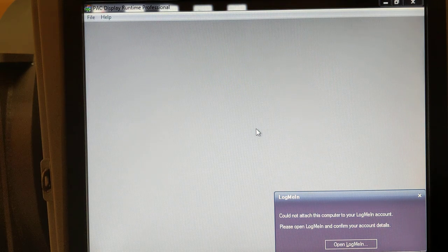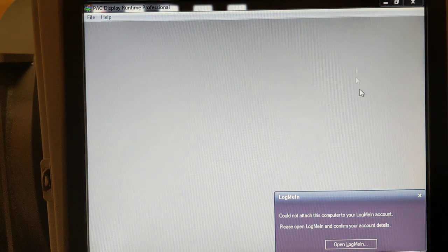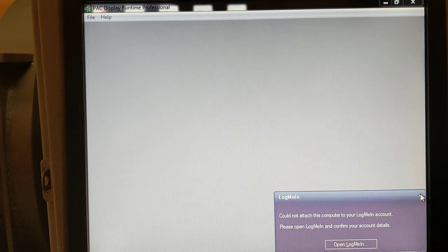Okay, so we get this interface pop up, and this is not the autoclave software.